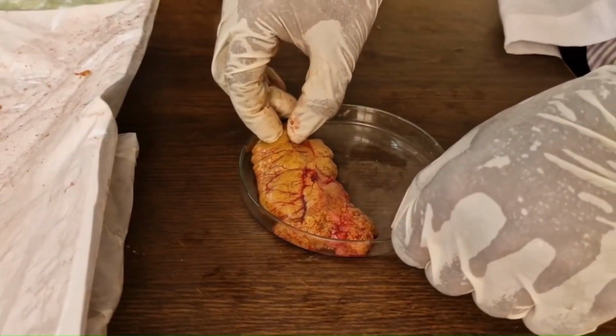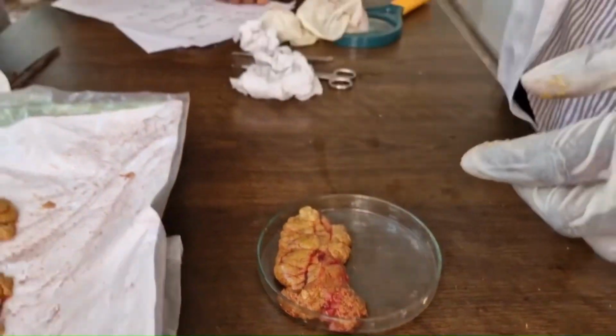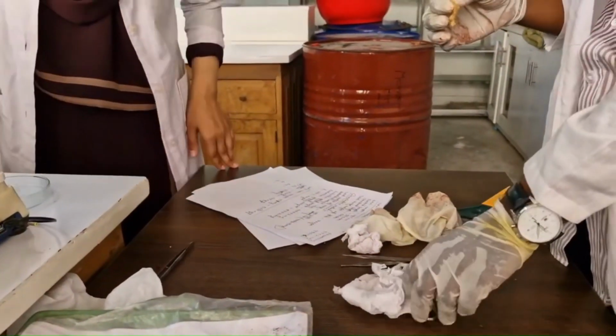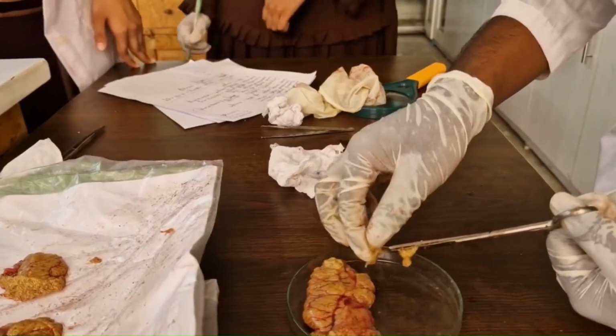Similarly, from the posterior lobe, we weighed the subsamples. F4 subsample weighed 330 milligram.